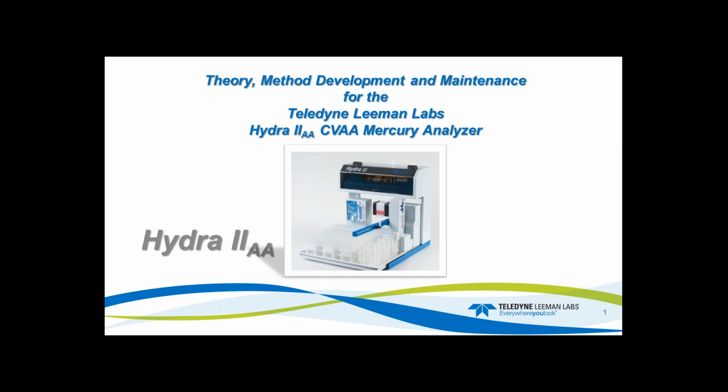Good morning, and thank you for attending. Today I'm going to discuss Hydra 2 AA. We will go over some theory, a quick review of the software, and then some method development.